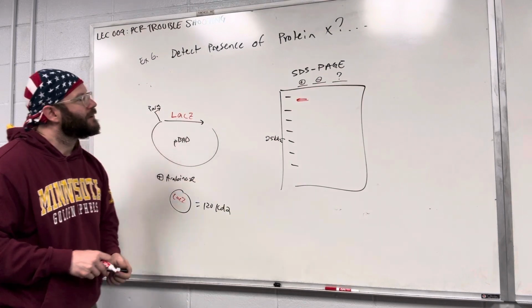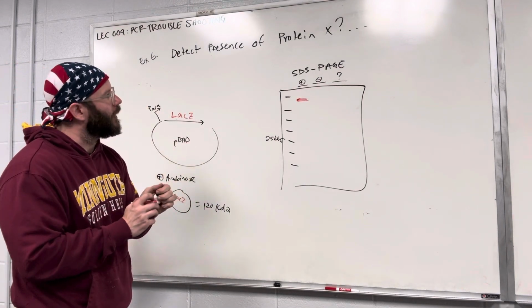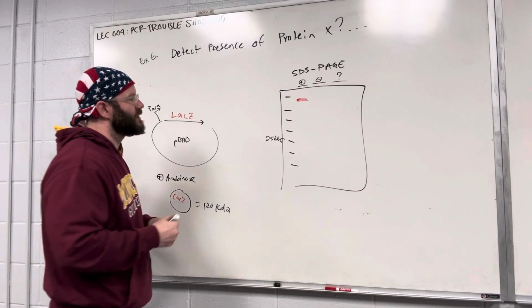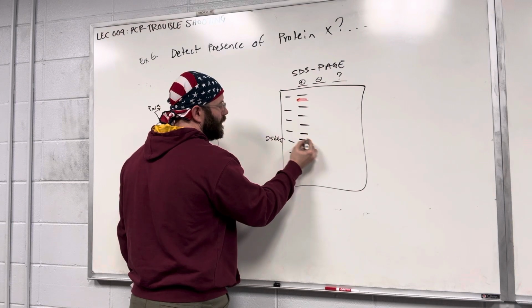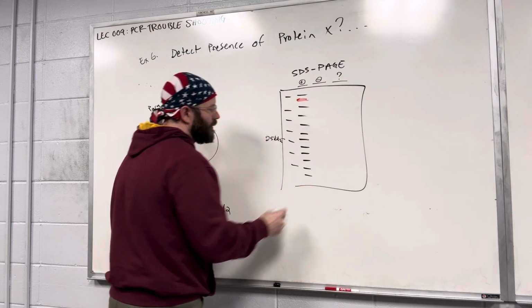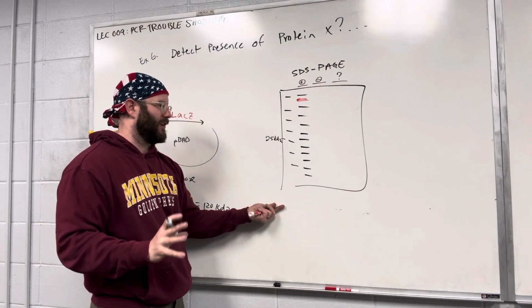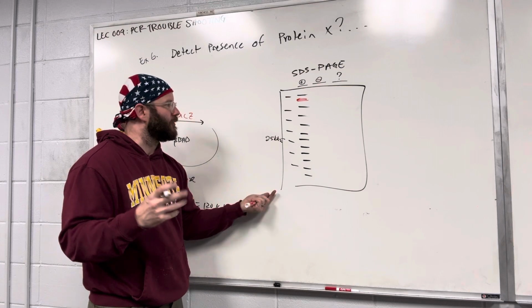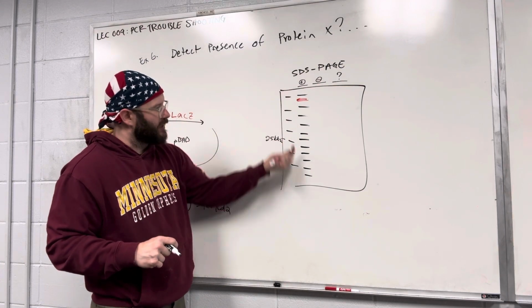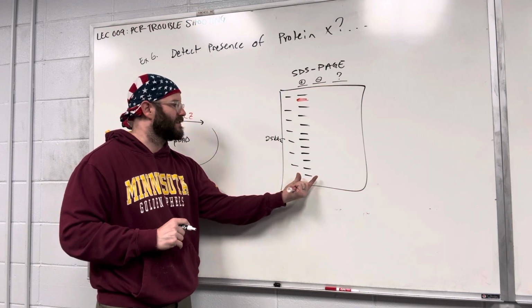Okay. And I should actually be more careful. Probably what you would see is something that looked like this. You'd see a ton of protein bands. If you didn't do any advanced purifications and you ran essentially global E. coli protein, you would see a ton of protein bands that represent the global constituents of protein in the cell.